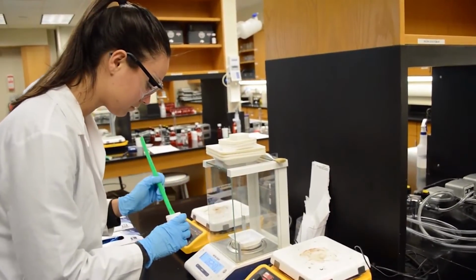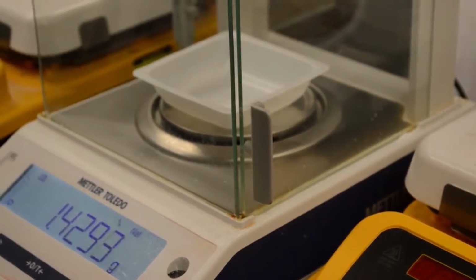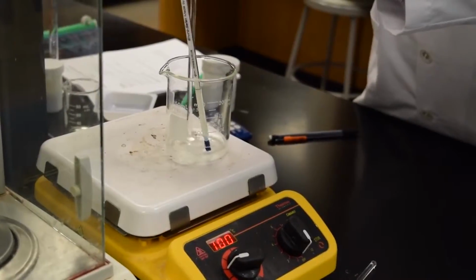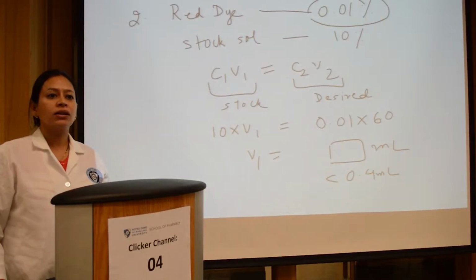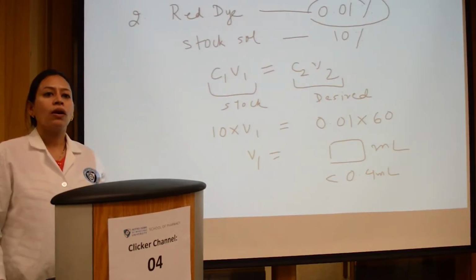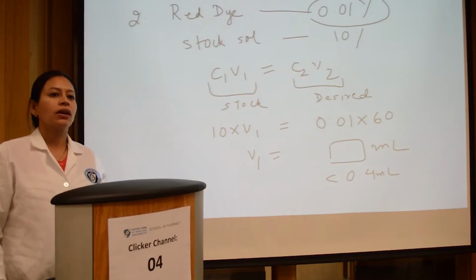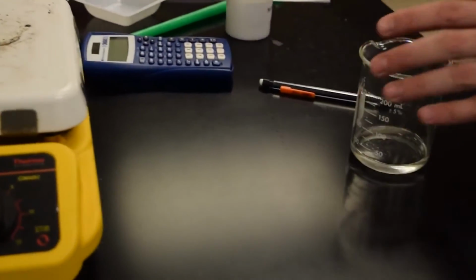Okay, so what is the procedure? You weigh out all the necessary ingredients given in the formulation based upon your calculation, right? Then you dissolve your sucrose in water with heat. When we are doing the heating method, it's really important for us to focus on the temperature, right? Because we cannot go beyond a certain temperature as it will result in burning of the sugar. So we want to make sure that when we are heating our sucrose in water, the temperature should always be below 65 degrees Celsius. Okay. So once the entire sugar component is dissolved in the water, you get your syrup.